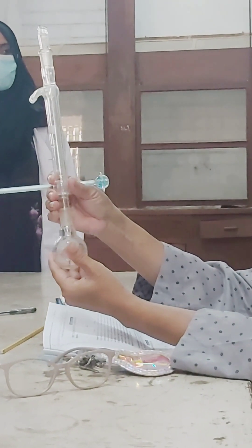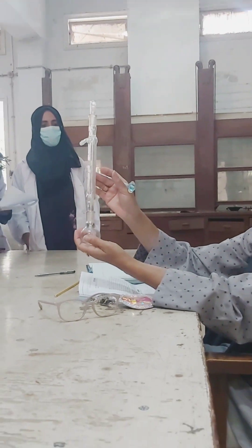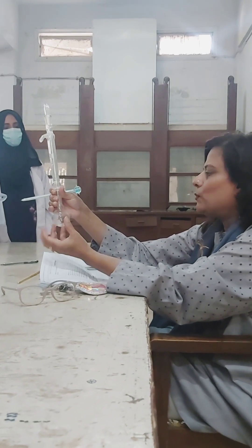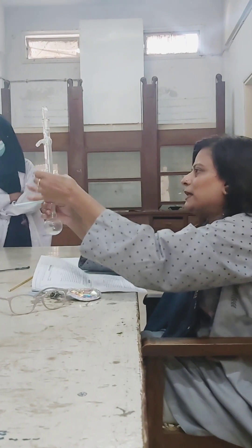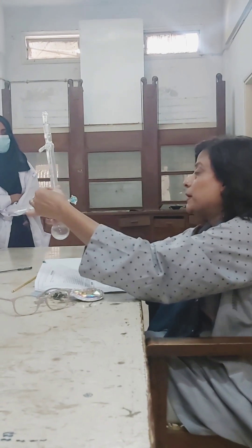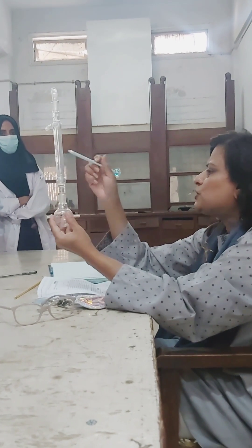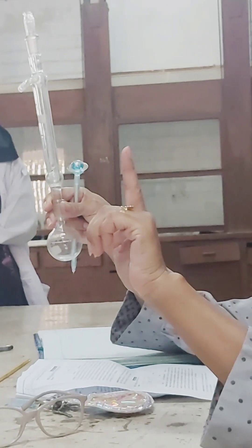When you start refluxing your sample, the nitrating mixture will be inside the flask. The vapors will start moving upwards, cool down through the condenser, and drop back into the reaction mixture. When the first drop falls back down, you should note the temperature — that is when your refluxing has officially started.